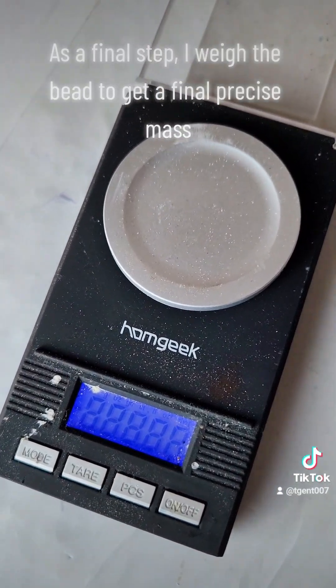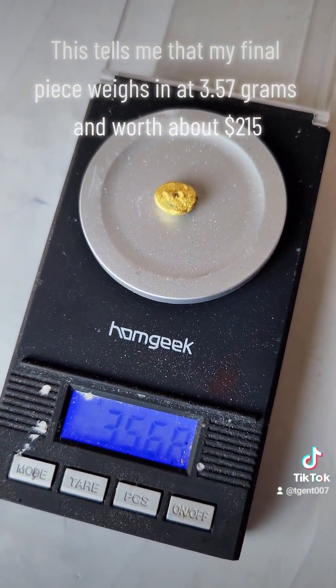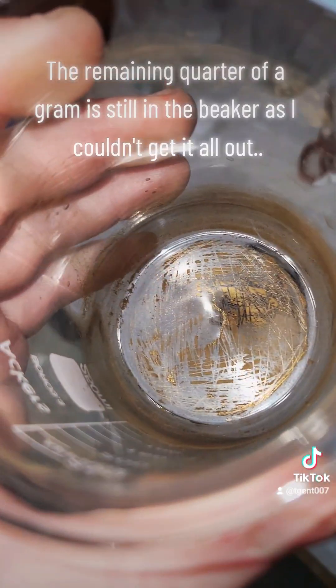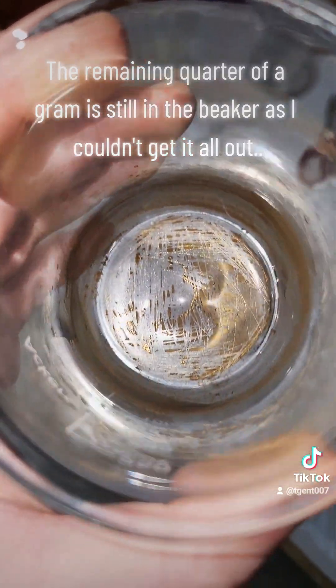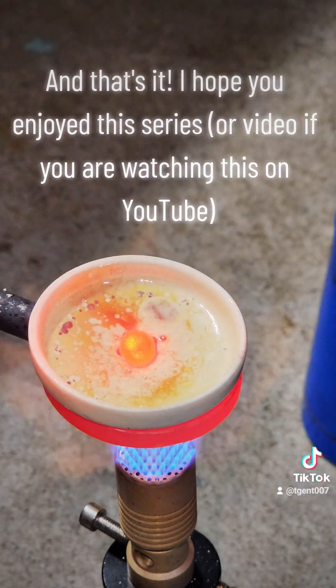As a final step I weigh the bead to get a final precise mass. This tells me that my final piece weighs in at 3.57 grams and worth about $215. The remaining quarter of a gram is still in the beaker as I couldn't get it all out. And that's it — I hope you enjoyed this series or video if you are watching this on YouTube.